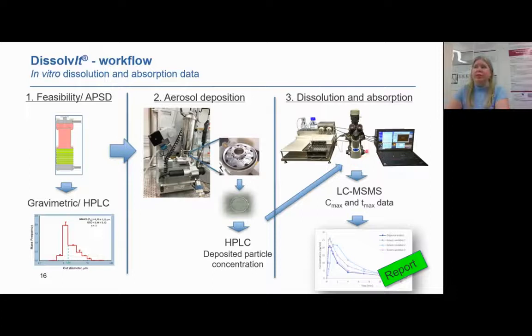And here is the setup that I will show you in the lab. So the dissolution part on the microscope, we have the pumps here with the perfusate, the fraction collector, and the computer that controls everything. And as I said, later on, those samples will be analyzed by using LC-MS, and by that you will achieve this type of concentration profiles.